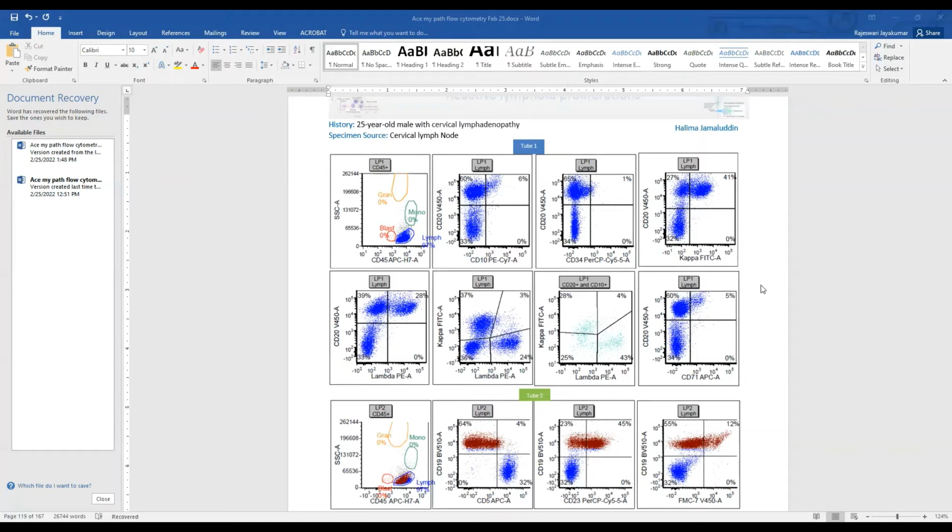So we want you to remember this because, under normal circumstances, the germinal center B cells are polyclonal. Just like here, the kappa lambda ratio is a little lambda skewed, but they are still polyclonal. But sometimes they can be very kappa skewed or even give an appearance of a kappa restriction. The population here is scant, just 6%, but sometimes you can see a sizable population that is kappa skewed or kappa restricted, and that sometimes is confused with follicular lymphoma.